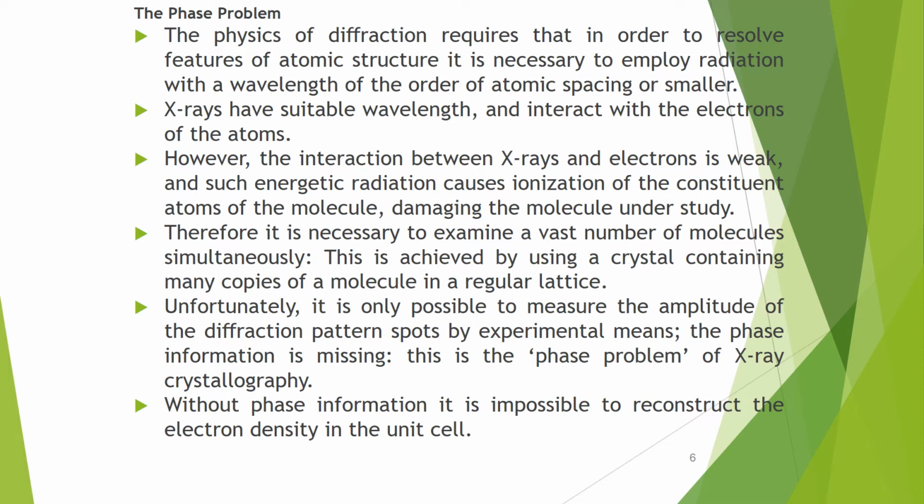The phase information is missing. This is the phase problem of X-ray crystallography. Without phase information, it is impossible to reconstruct the electron density of the unit cell.